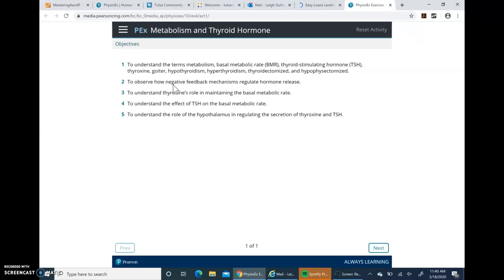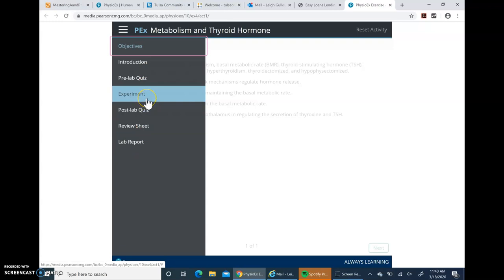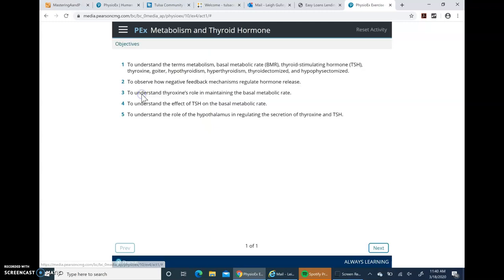There are your objectives. Because you're not required to do the pre or post lab quiz, and you have a document provided on Blackboard that you'll complete as you do this activity, here's what you want to do. Click on these three lines up here — I call it a hamburger. We're going to click on that, and you can see all these items. The only thing you need to do is go directly to the experiment.